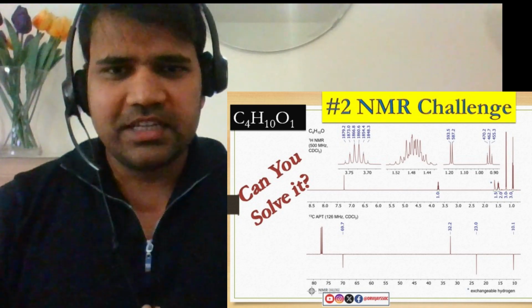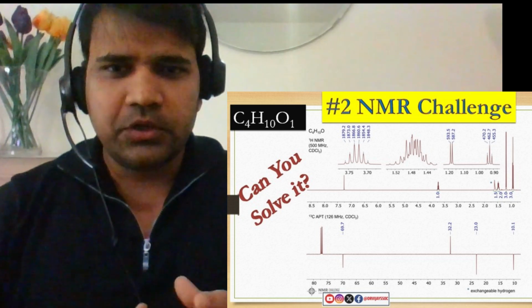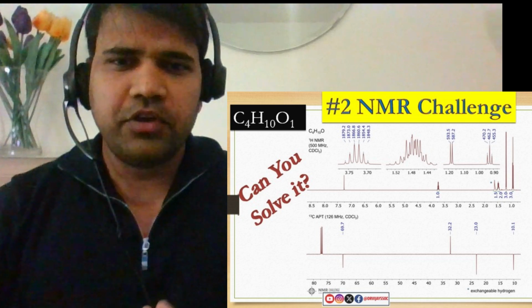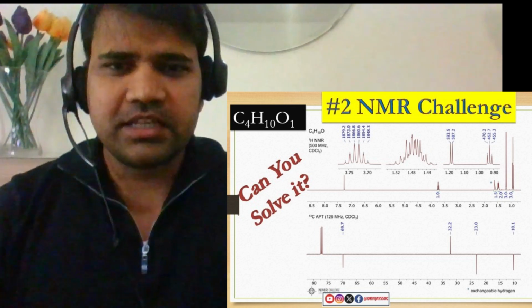Welcome back to the NMR Challenges series. In the previous video, I provided this NMR challenge for you, and today we are going to explain the solution step by step. If you have already solved it, then you can match your answer by the end of this video. So let's start today's NMR challenge.